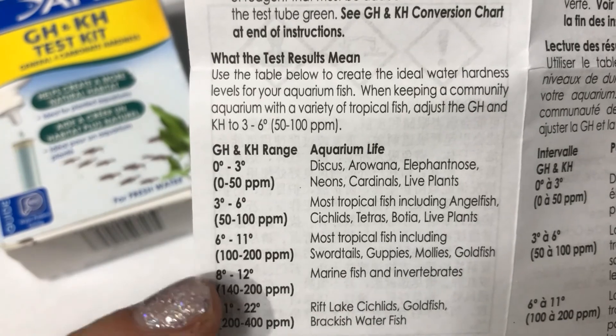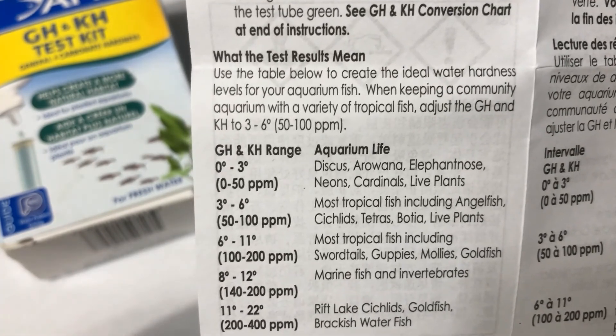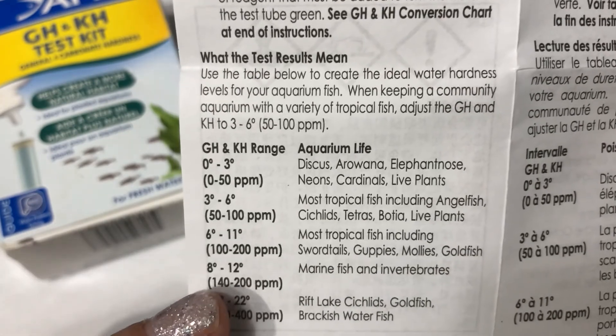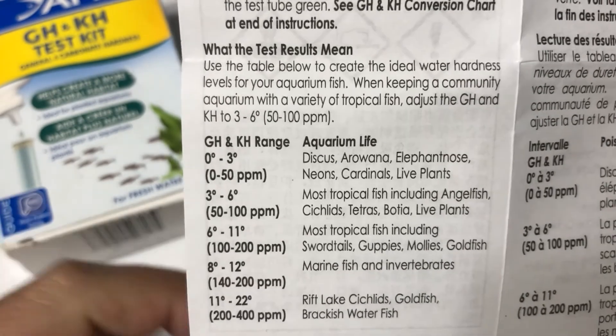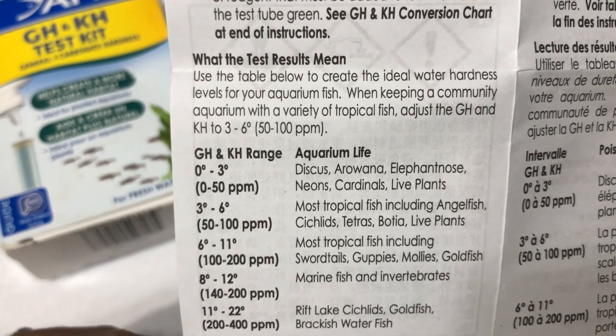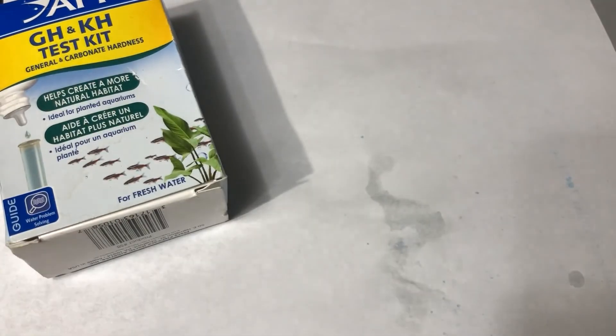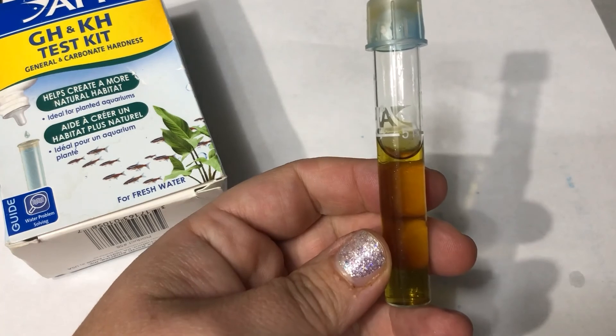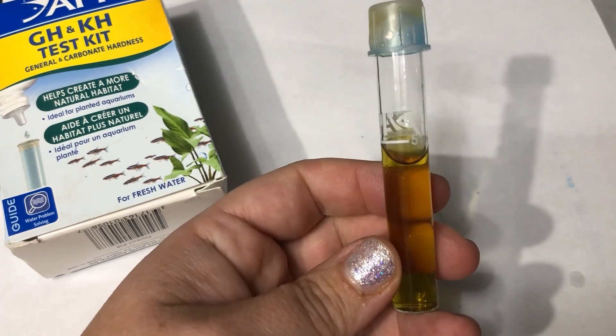We want to make sure those levels stay near these values. When we add the fish or change filter material, those numbers might change a tiny bit, but as long as your water source is stable, they will stay stable. This is the water test for week one — or week zero since we don't have fish yet. We'll be doing these tests every week once we have eggs.